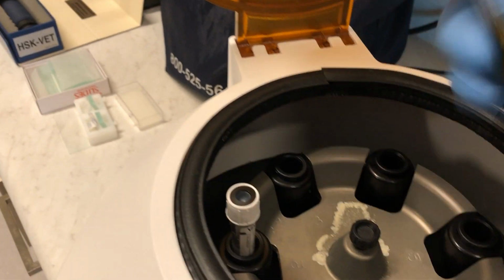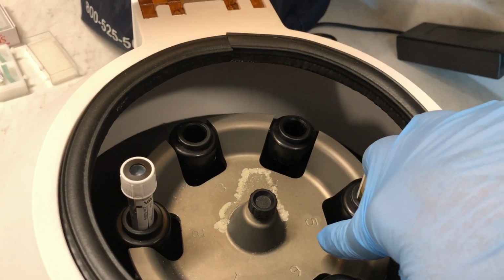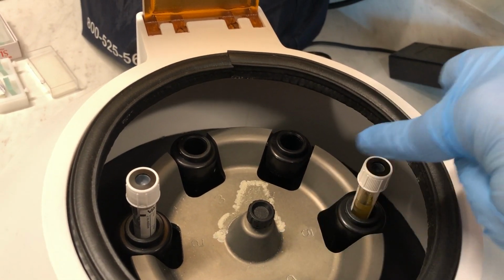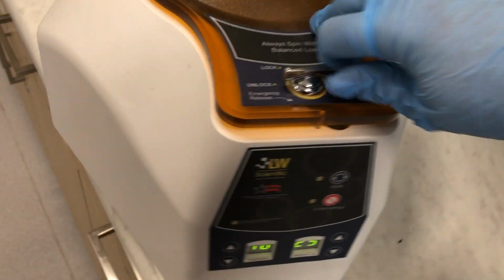So you take your tubes to the centrifuge, and you need to place them across from each other. If you're spinning with other samples, you can also keep track of what number you put your tube in. So this one is going in the number 5 slot. Then you close, lock the lid.